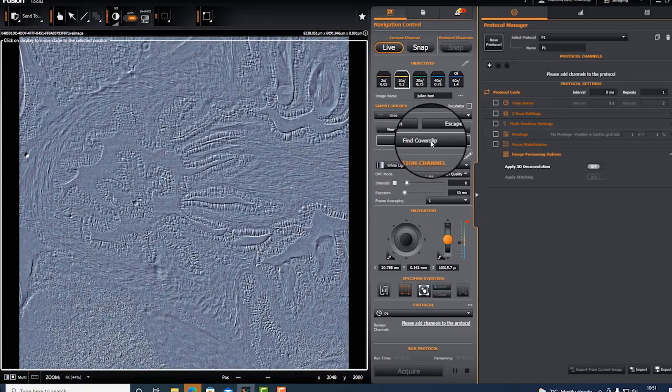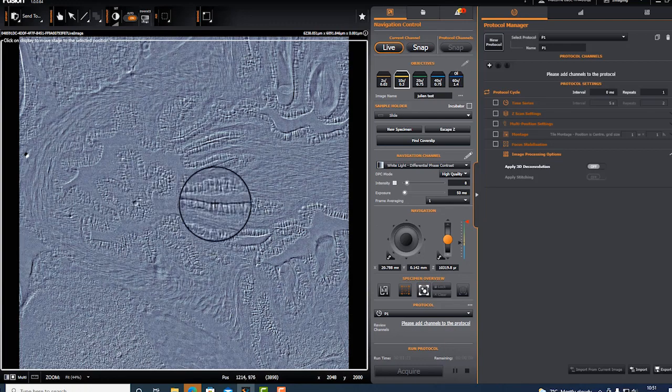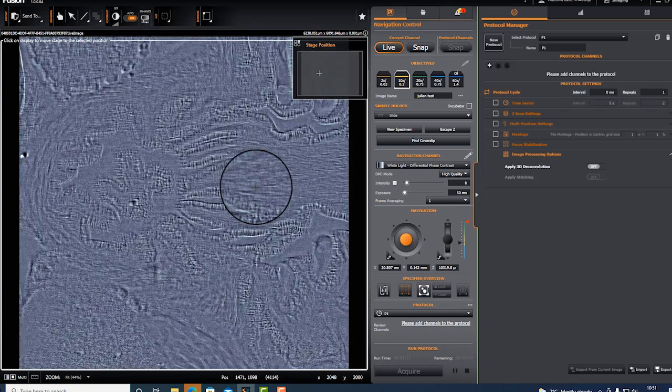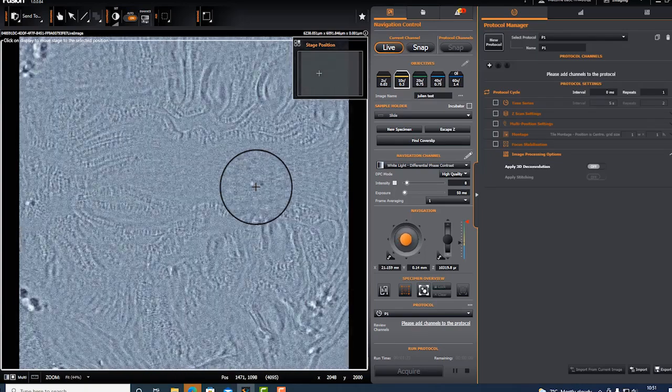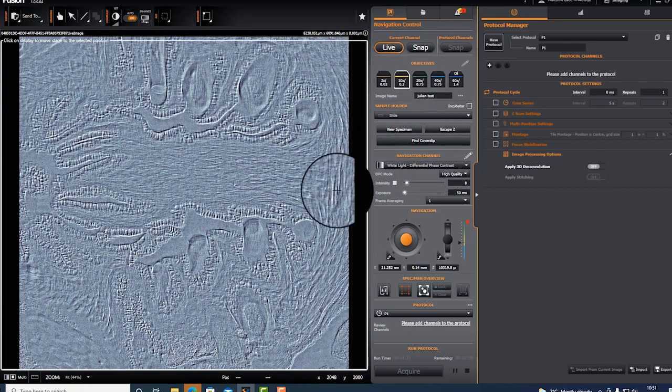If the focus was not found as previously shown, you could use the find cover slip, and I can define my stack a little bit more. I could decide to acquire a montage in this area. Maybe I know my sample quite well, maybe a little more towards the left, and do a 2x2.